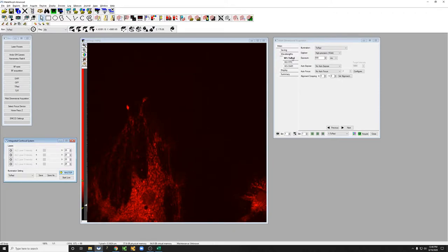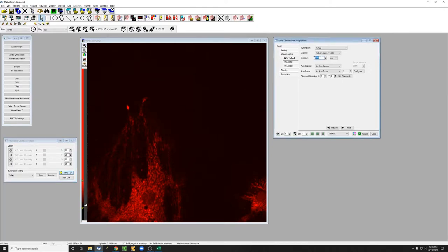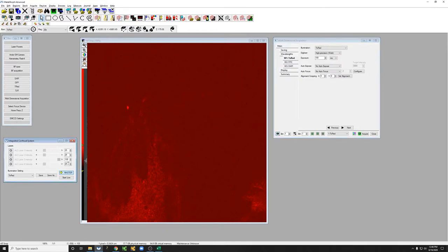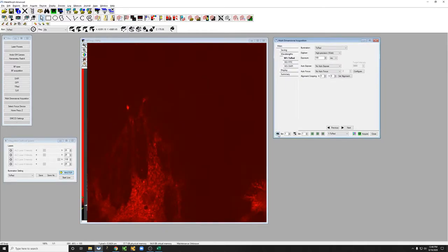Since we're looking at the Texas Red, one way of improving the quality of this image is increasing the laser power. Let me show you an example. If I go to an exposure of 100 and take an image, if I now increase this from 25 to 100 and take another image, you can see that the quality is higher.